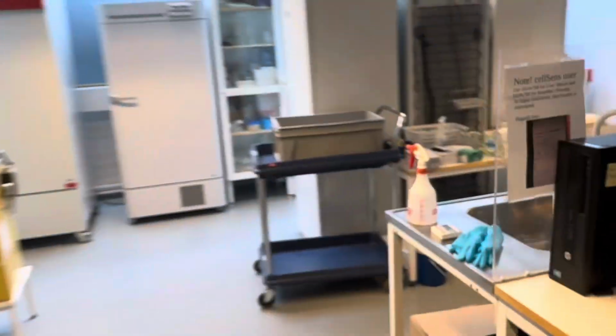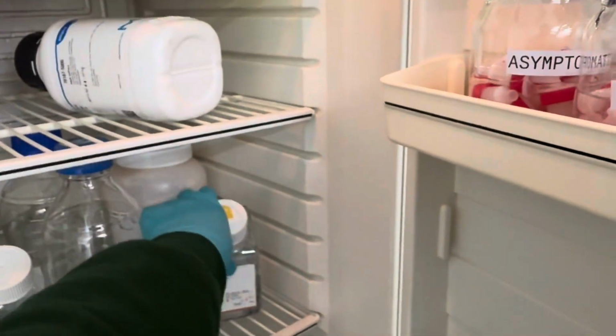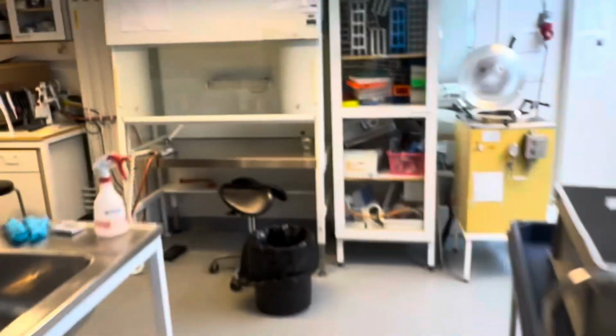Let me take you to take the malt extract, because we need to keep malt extract in the fridge, otherwise it can degrade easily. So this is our lab fridge, and here we have, you can see malt extract. I'm taking this with me. Oh wait, I need also something on which I can weigh. First I will close this door.